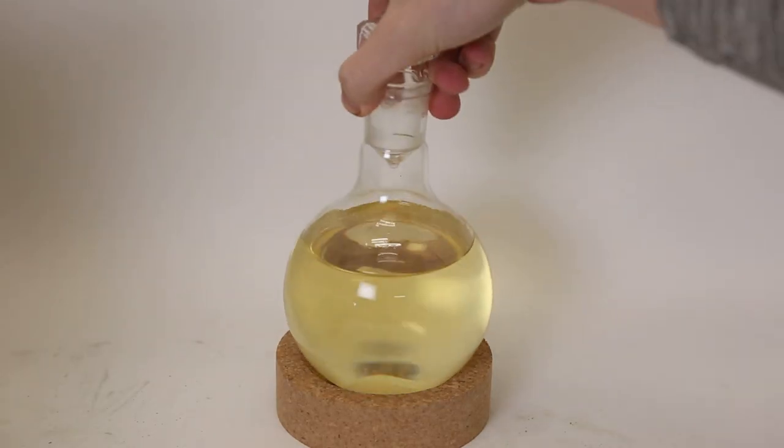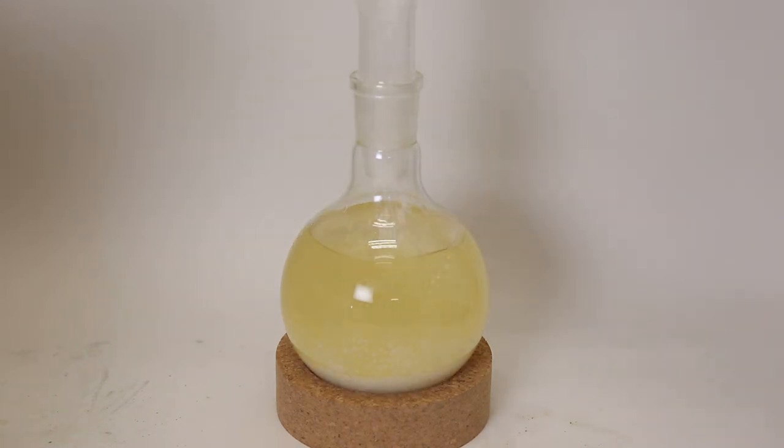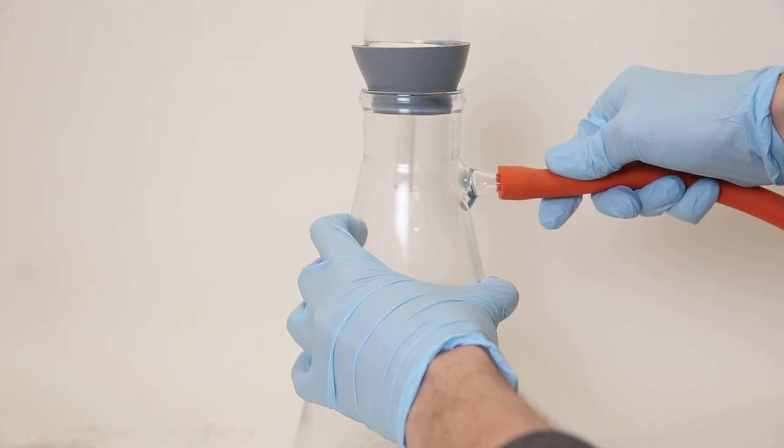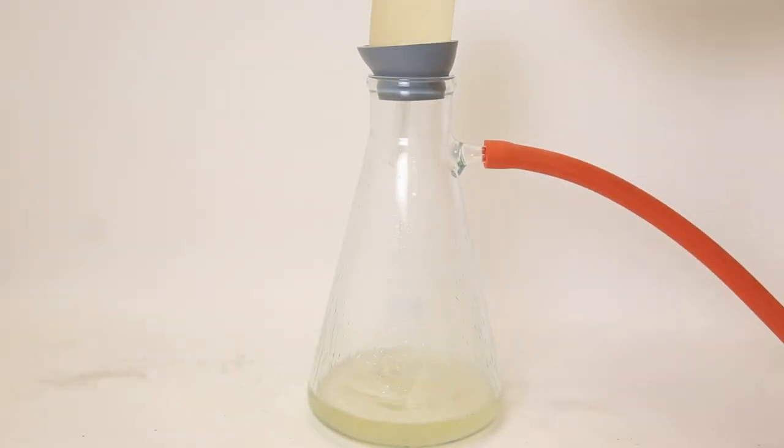After washing and boiling the biodiesel, there still is water left in the biodiesel from the washing steps. So like I did with the sunflower oil, I dry the biodiesel with calcium chloride, and then, after it has been sitting for a day, I set it up for a vacuum filtration to filter it all out. This time I can use a glass filter, since biodiesel is a lot less viscous than sunflower oil, and it can pass through much easier.